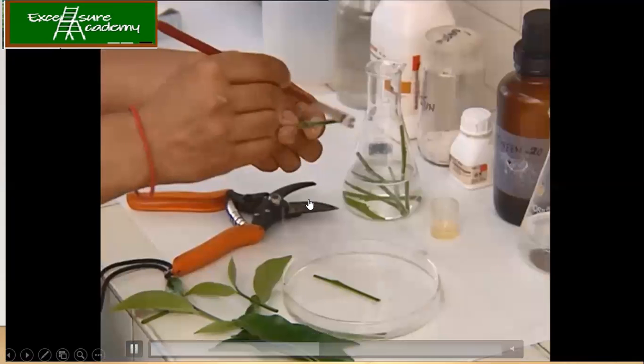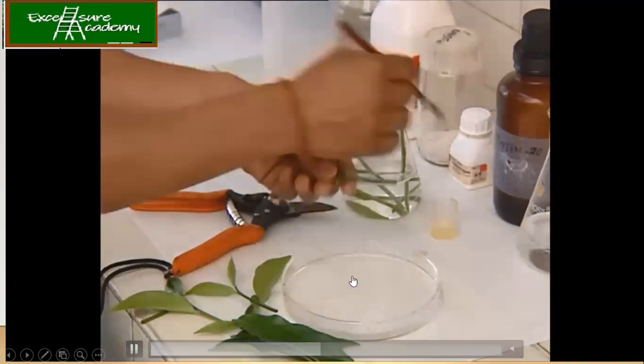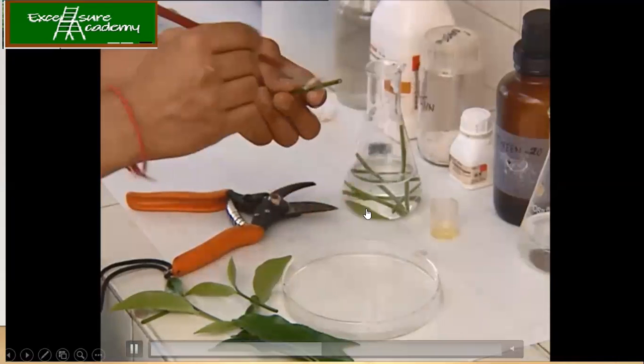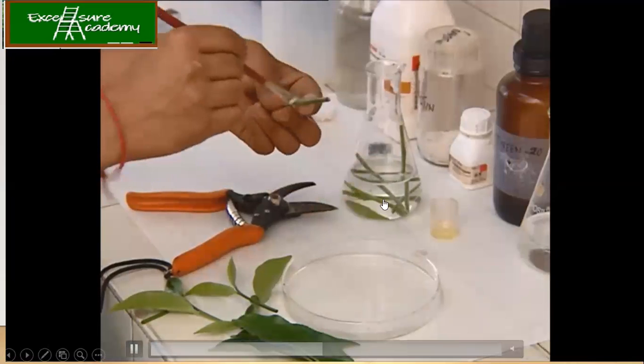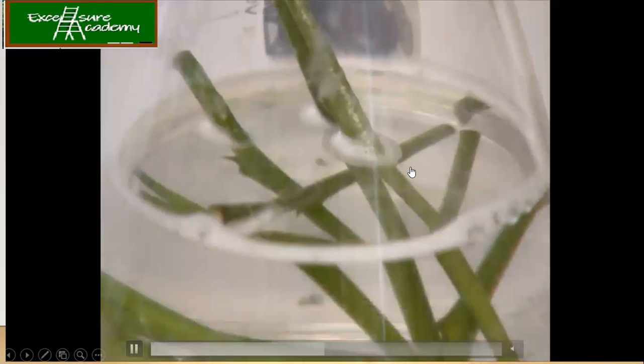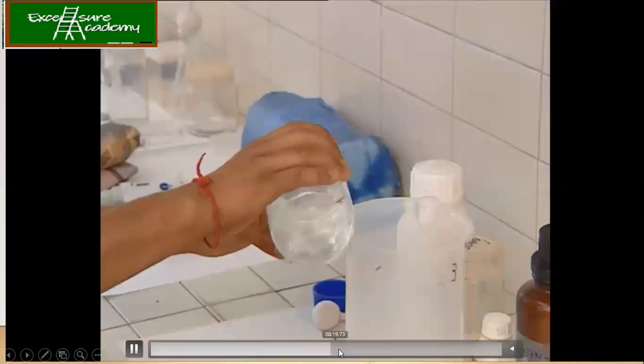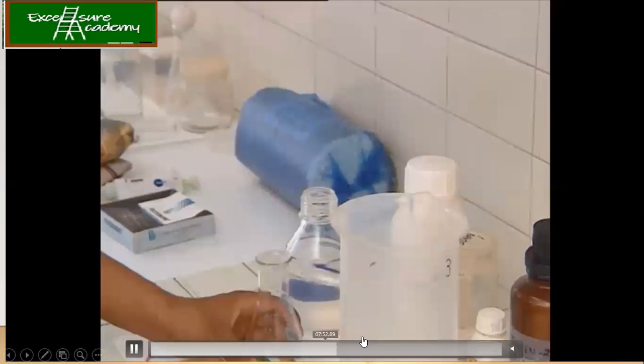Now what they're doing is the surface sterilization. They have added sodium hypochlorite. They're just cleaning the surface and then putting it into the solutions of water. After that, you wash it around 4 to 6 times with double distilled water. Okay, so now washing has been done.